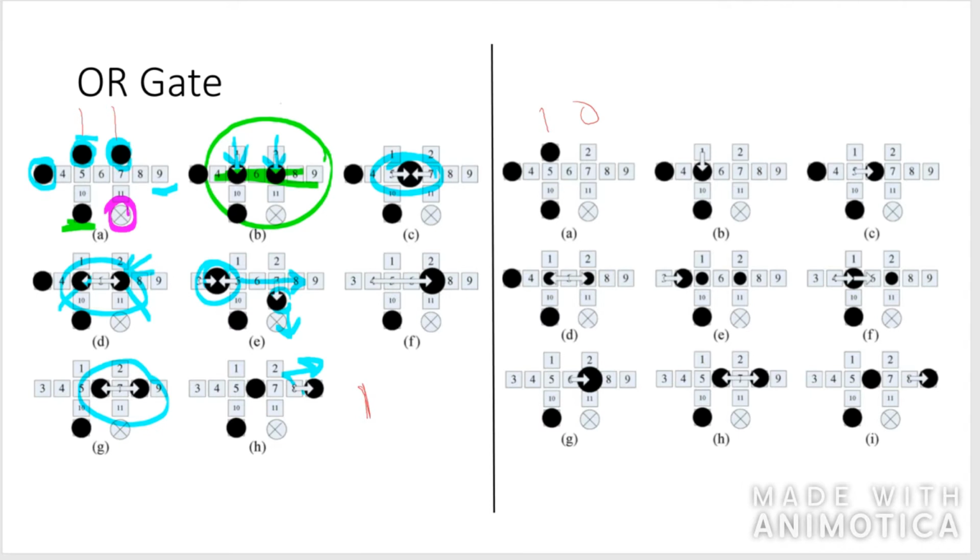For the input 1, 0, a similar procedure occurs, except in this step where the droplets are split after they've been merged, there are two 0.5x volume droplets, and since there aren't two 1x droplets present in the channel at this time, neither of them are diverted into the waste reservoir, so this remains empty.